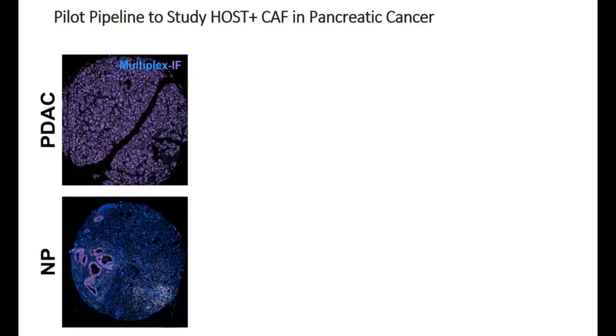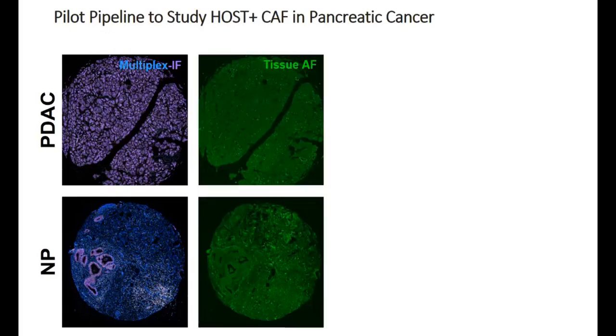And what we did is now based on the same autofluorescence that I was mentioning that we need to clear in order to do the analysis. So we also use that particular property of the tissue to identify in the image, in a non-biased and automated way, where is the tissue.